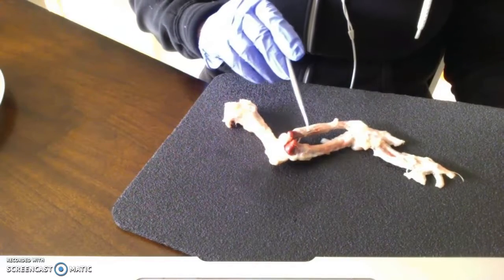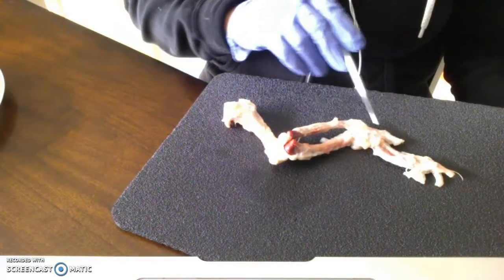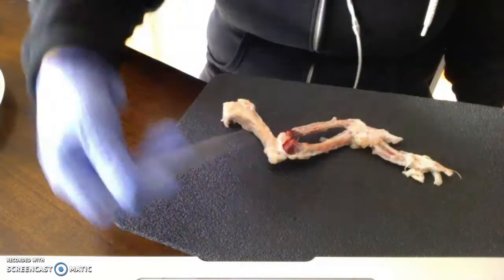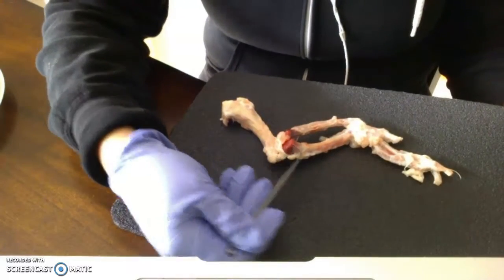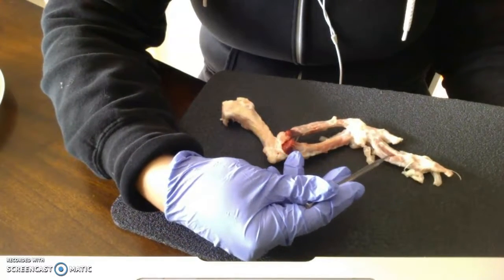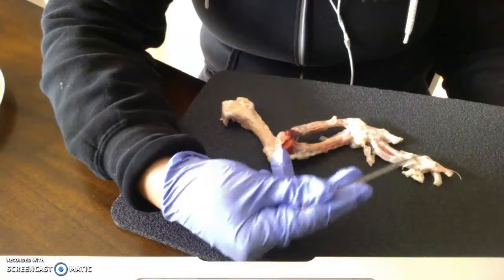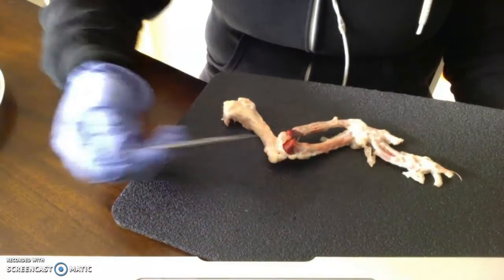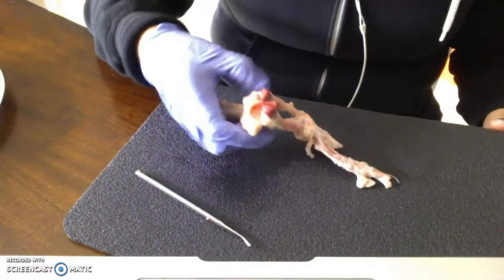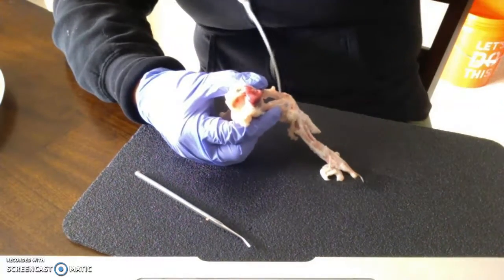This is our radius in anatomical position on the right side with the thumb, and this is our ulna going back into what would be represented by our metacarpals going into our phalanges. So let's come back to the joint.